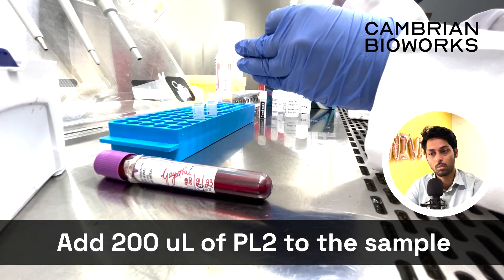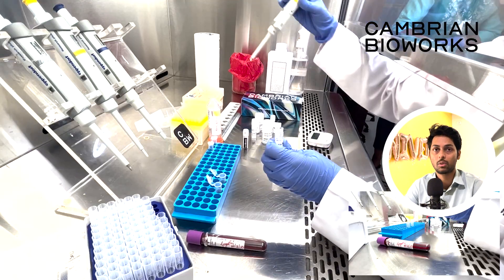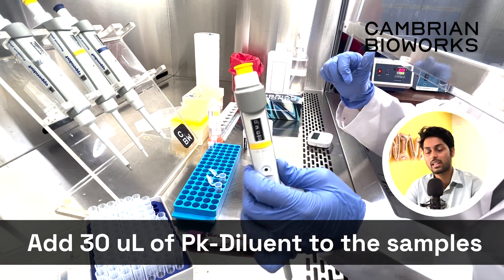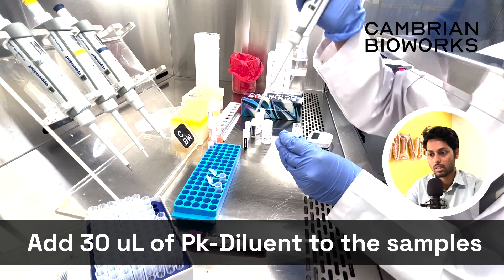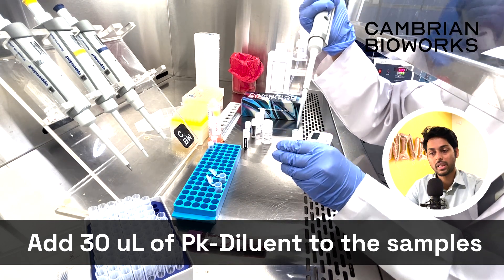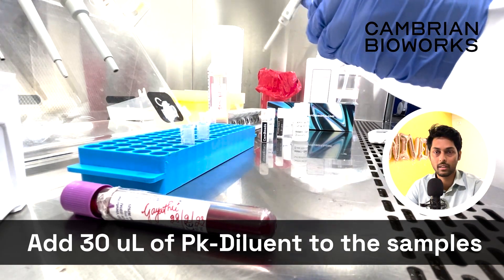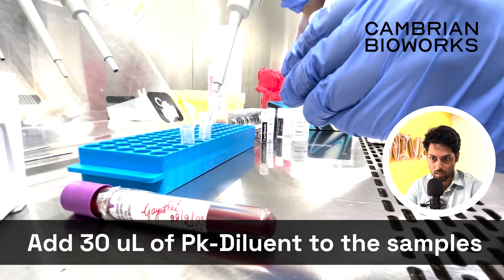PL2 is what you start with in the case of whole blood. Like I said, for other kinds of sample types you may have to start with PL1, but more information about that is in the links below. In the case of whole blood, add PL2, add the sample, and to this mix add 30 microliter of Protein SK diluent that you've just prepared and kept aside. This is what we call a lysis mix.